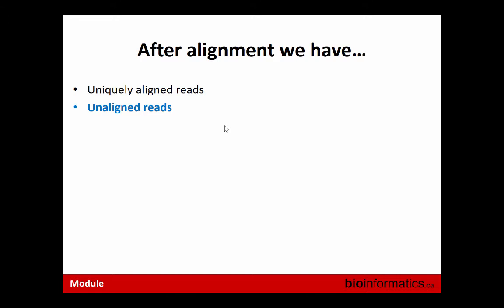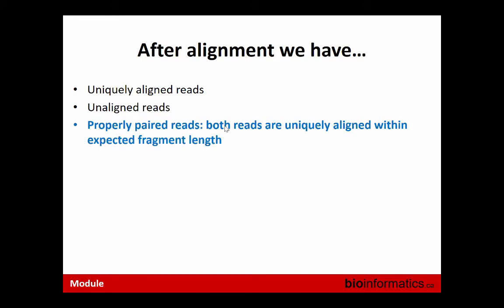What else? Could be contamination, where the read comes from a different species, like bacterial. Or, for example, it has adapter sequence in it, say a 10-mer. So it's too expensive: at the very beginning of the read, we have a 10-mer which doesn't belong to the human genome, and it was not properly trimmed. We can't align it. So what's the next class of reads?